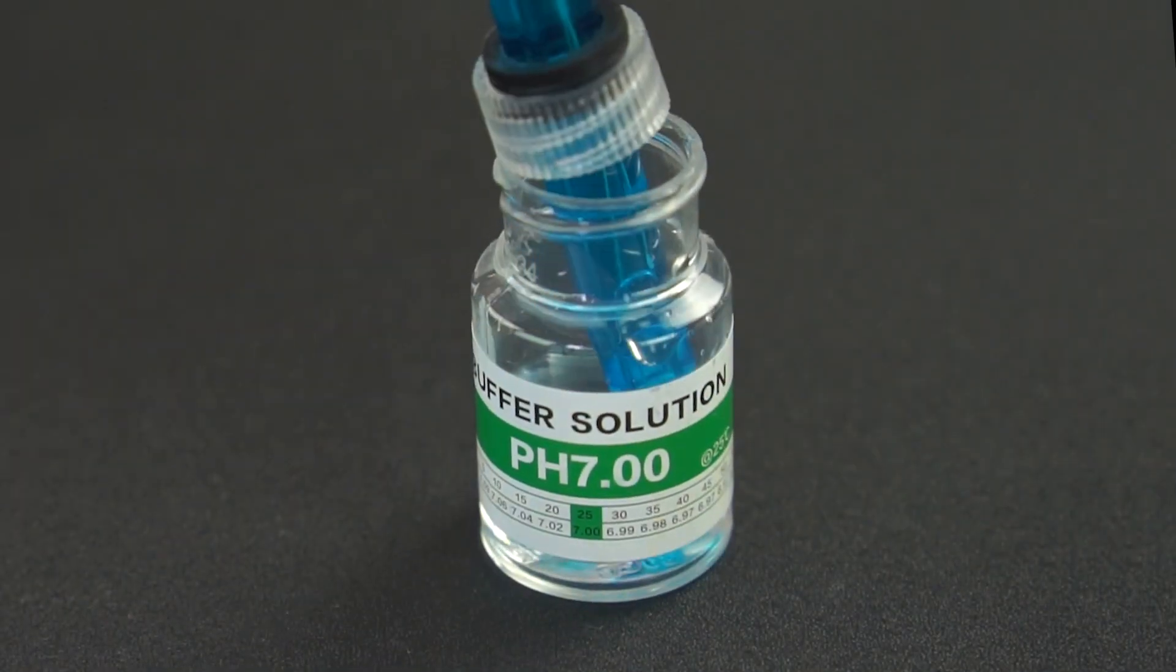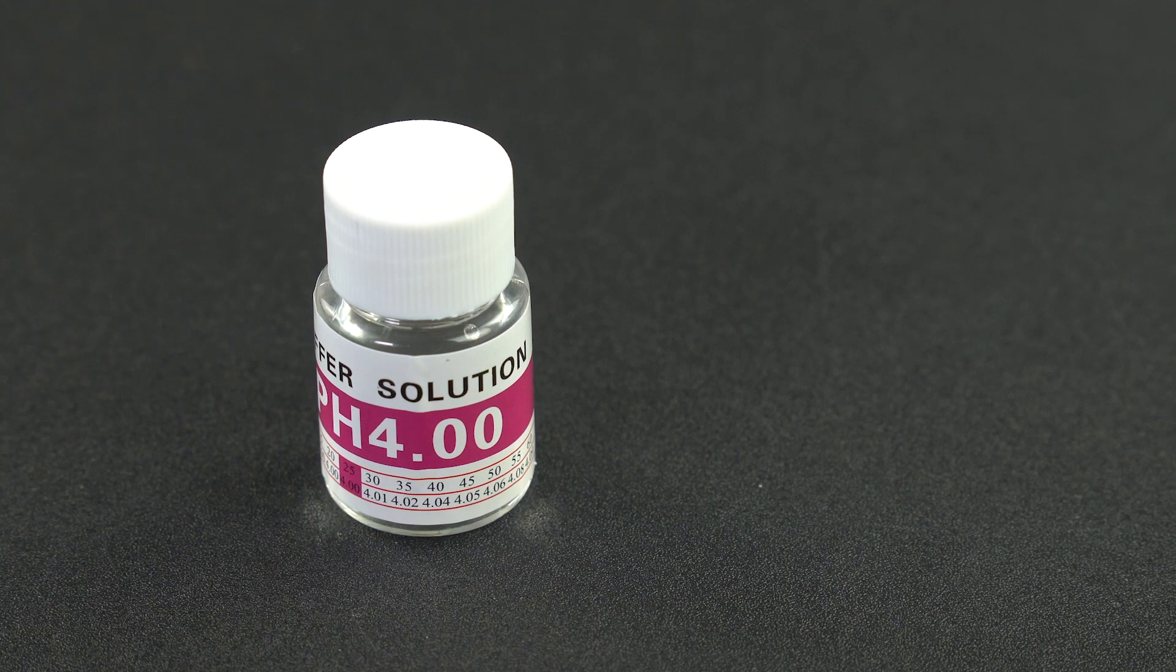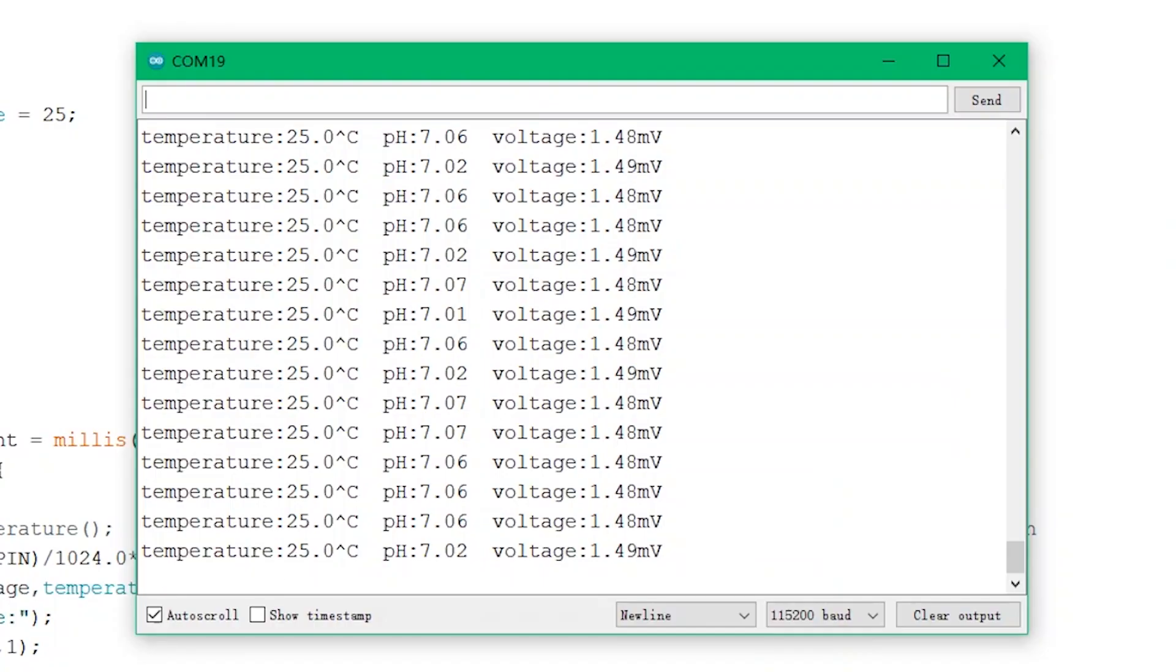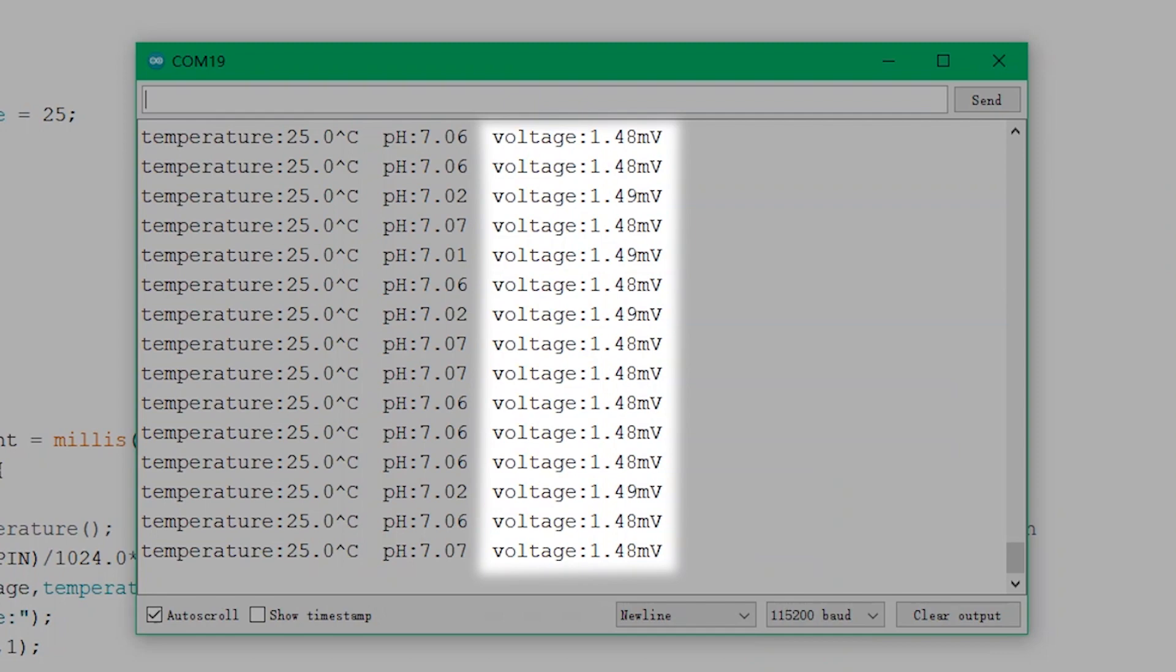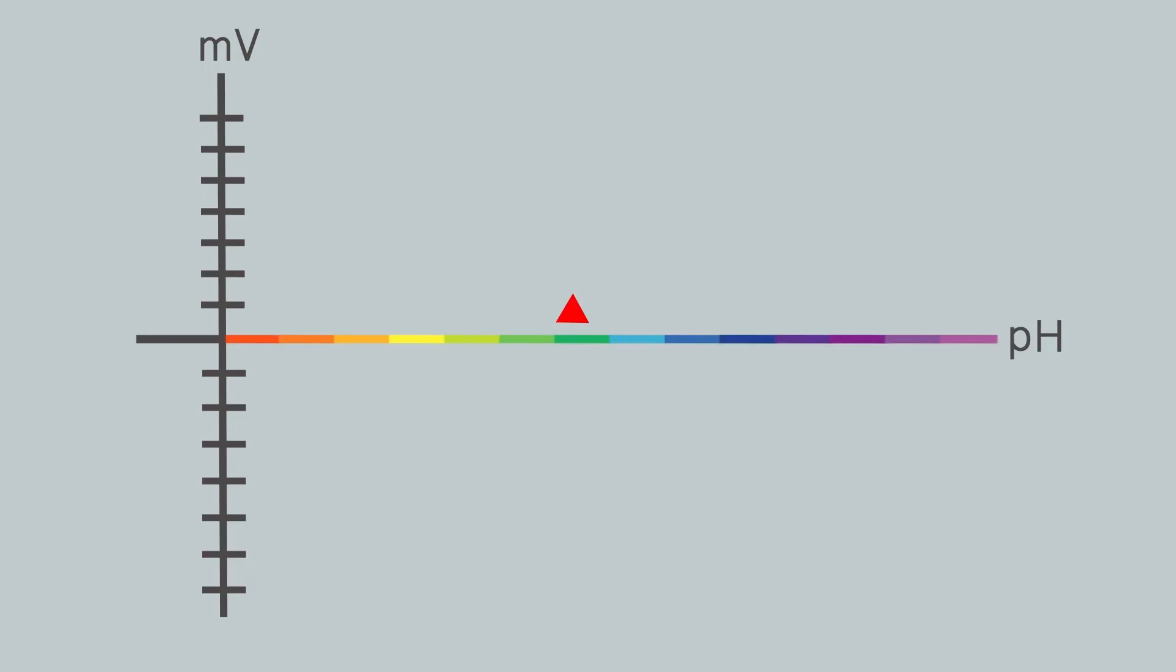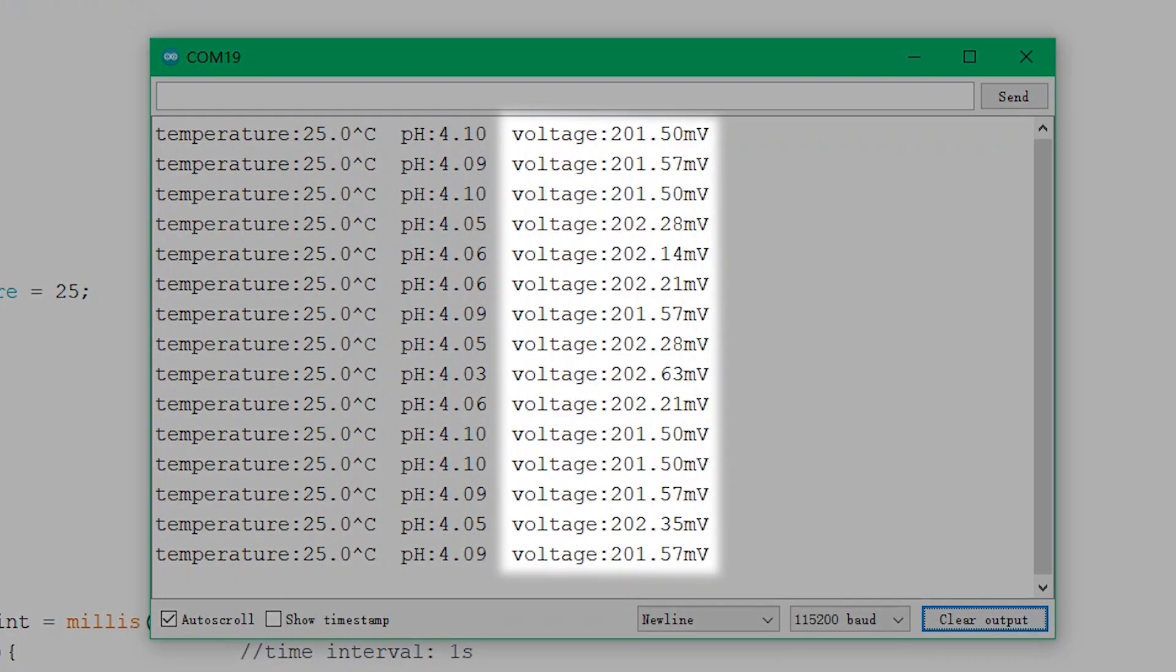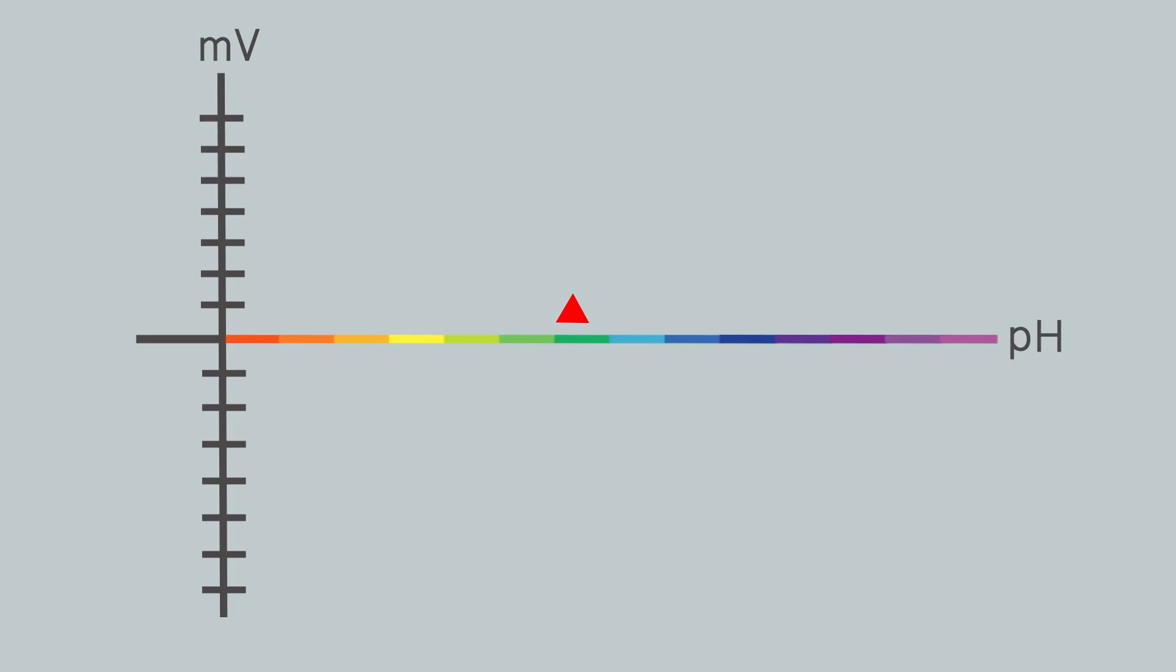Immerse the probe into the proven buffer solutions, for example, the pH 7 and pH 4 standard solutions. Get the voltage reading at pH 7 and mark it in the graph. Get the reading at pH 4 and mark it. Connect the two points with a straight line and extend it. Then, a pH versus millivolt curve is done.